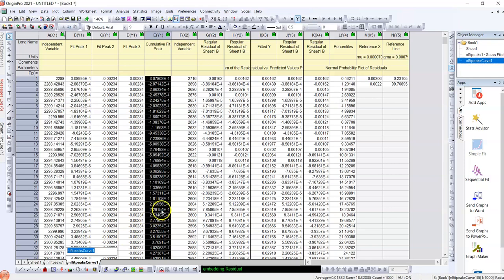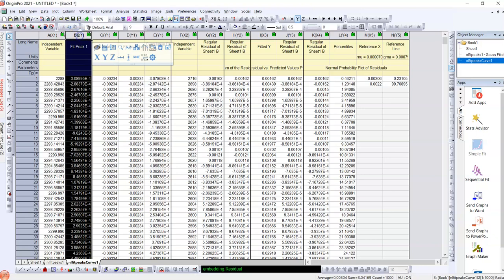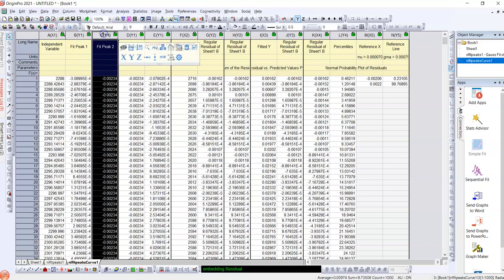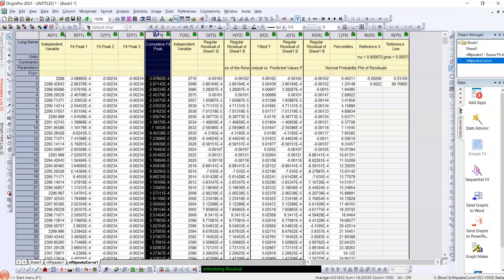Now we go again to Windows and Book One. Data is here, third data, gives us the peak one data. This is the independent variable that came up in the x-axis only. Y-axis for peak one, Y-axis for peak two, Y-axis for peak three. And last one the cumulative peak. And these all are for residuals.